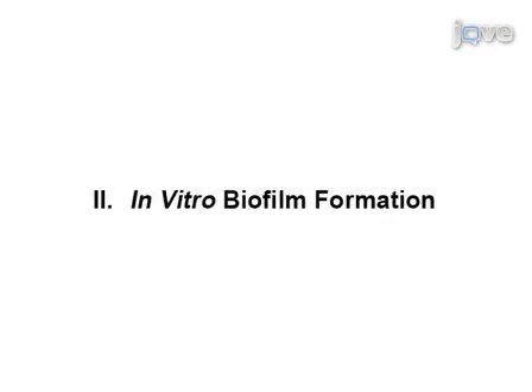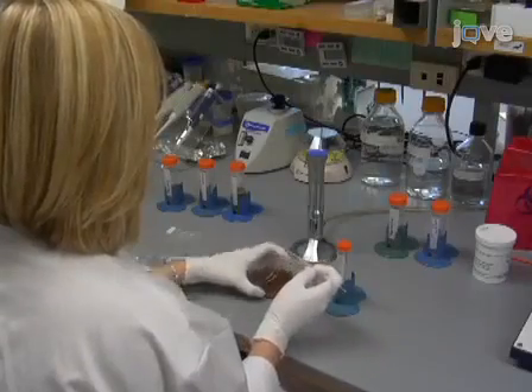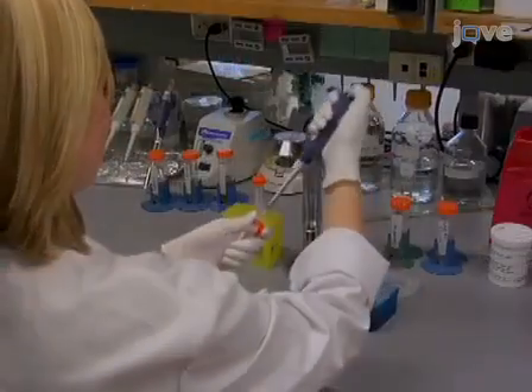Demonstrating the procedure today will be Liz, a grad student from the laboratory. Inoculate bacteria in liquid culture medium and incubate the culture until it reaches mid-log phase, then dilute the mid-log phase suspension.